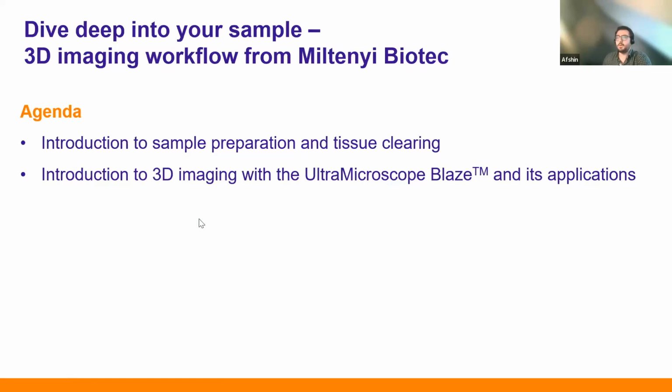So our talk has two parts. Firstly, I will go through the sample preparation and tissue clearing, and then Luigi will take over and talk about our light sheet system, which is called UltraMicroscope Blaze.